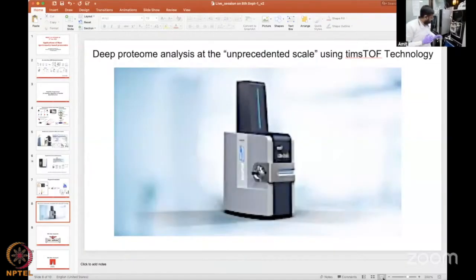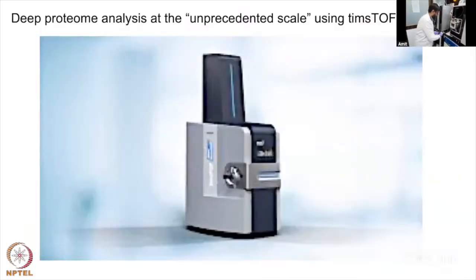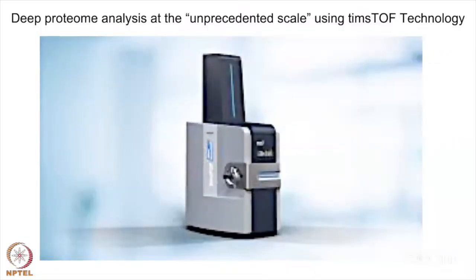All right, thank you, Ankit. Student participants who are available online, whatever different types of theory you have studied already, now you can see the actual practical aspect of it along with the instrument demonstration.